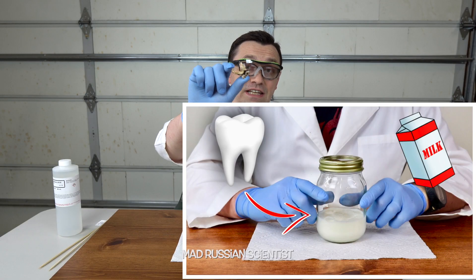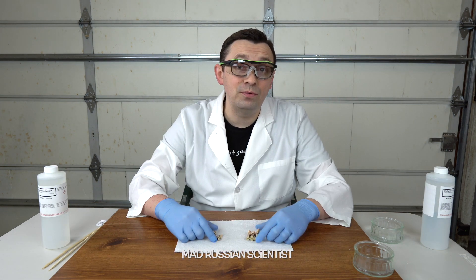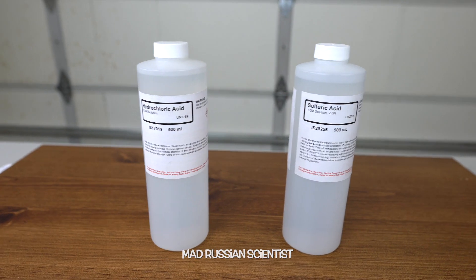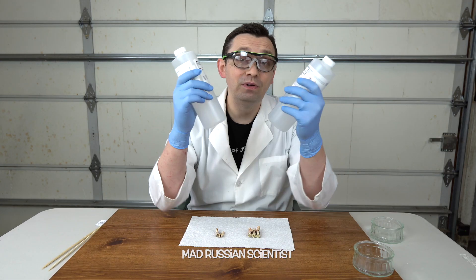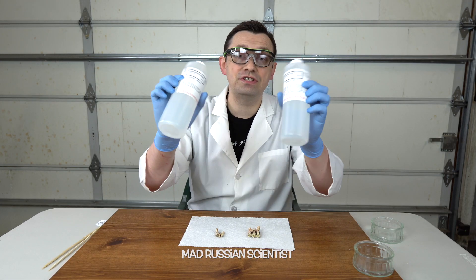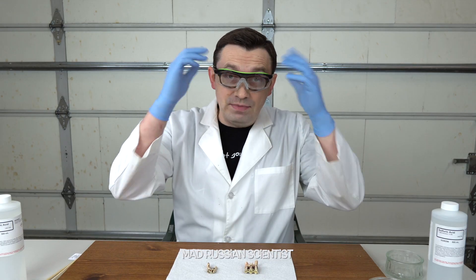Hello guys, how are you all doing? Recently I made a video where I put cow's teeth into different liquids for seven days, and I still have two teeth left. So I decided to see what happens if I put hydrochloric acid and sulfuric acid on those teeth — will they actually melt or not? I'm very interested to see how much damage these two acids can do.